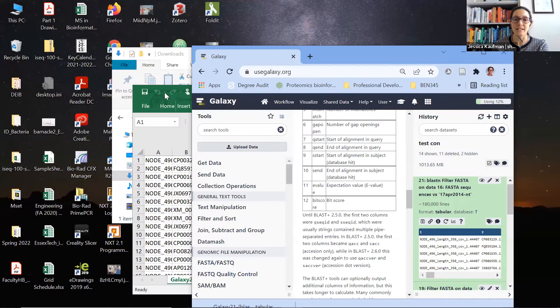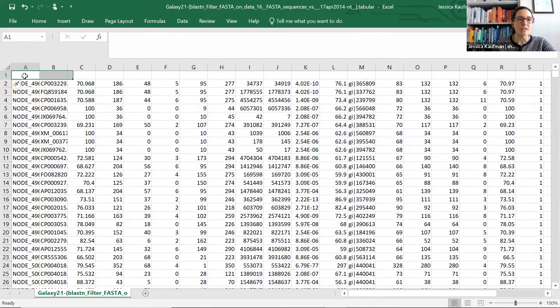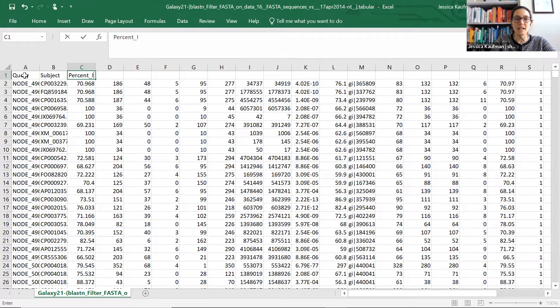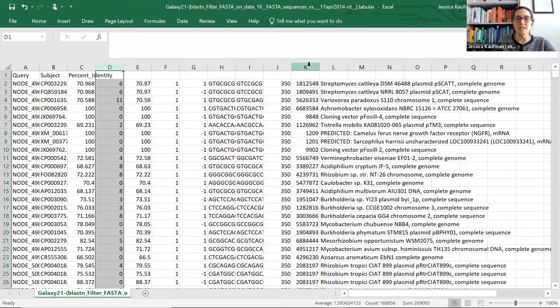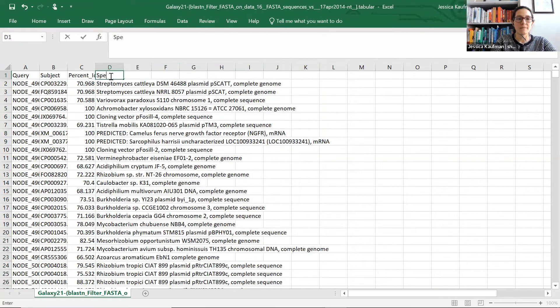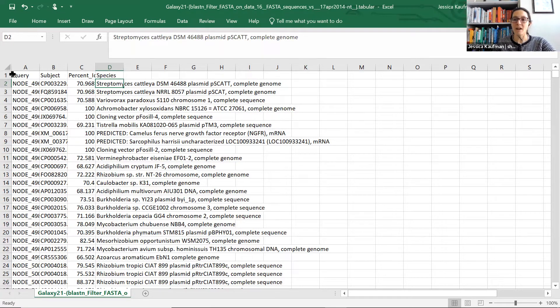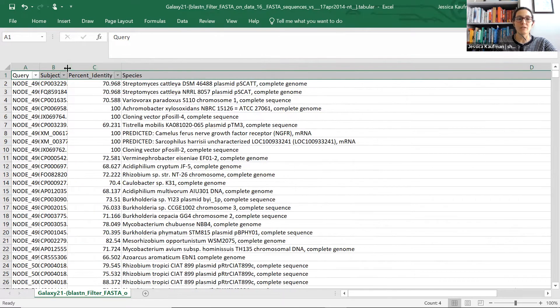So if we go back to Excel, we can type those in for those columns. I'm going to insert a row and name the columns: query, subject, percent identity. And then the final column in the spreadsheet is going to be the species name, so I'm going to delete everything except for the final column, and this is going to be species. Now that we have column headers, we can highlight those headers, go to Data, and add a filter so that we can better view the results of the BLAST search.